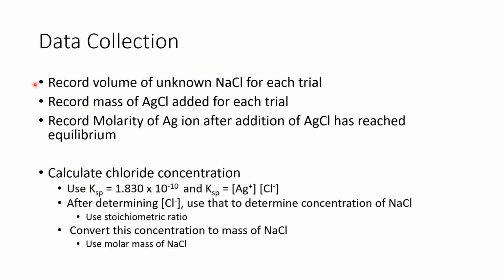I mentioned this during the procedure video, the little screen capture, but you're going to be recording the volume of your unknown NaCl for each trial. I have a table where you're filling that in. You're going to record the mass of AgCl added for each trial. That is stated in the procedure. It tells you how much to add for each trial. And then you're going to record the molarity of the silver ion after the addition of our silver chloride, after it has reached equilibrium. So you just click on the information tab.